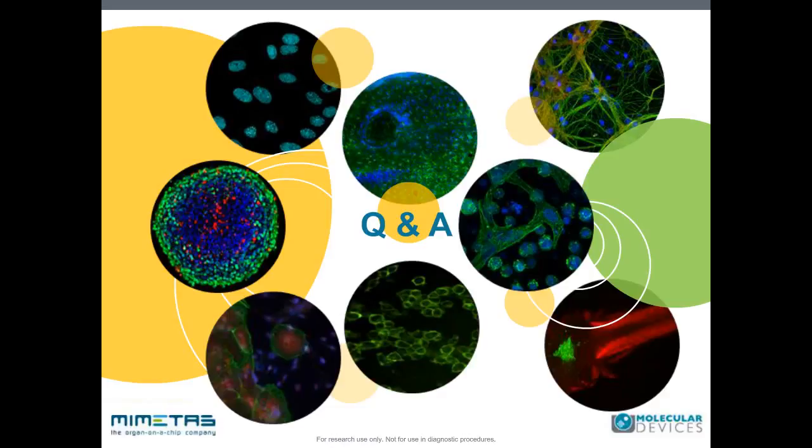So we pre-establish leak-tight tubules before we start to use them. Depending on the application, there's a range of assays that we can apply before we do the real measurements. But usually they're image-based because that's the best way to get into the OrganoPlate without disturbing the cultures.